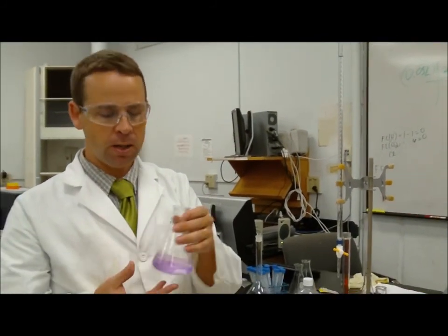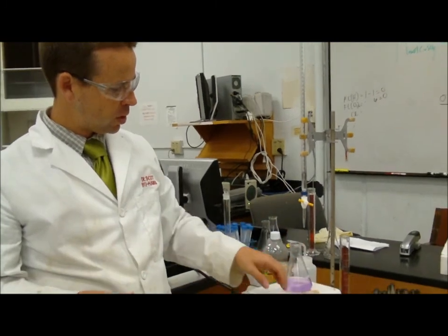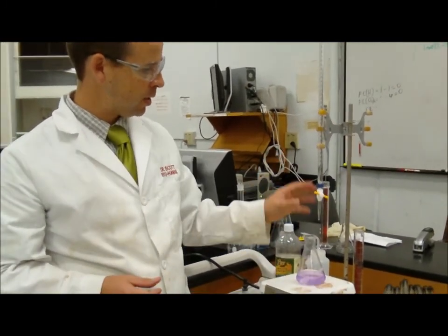So I know that the moles of sodium hydroxide that were necessary is stoichiometrically related to the moles of copper here. All right, so that's an example of how to use the titration equipment with a slightly different method of titration. All right.